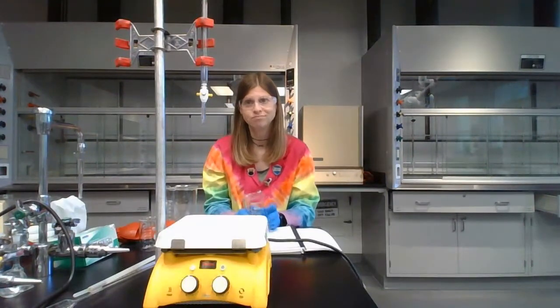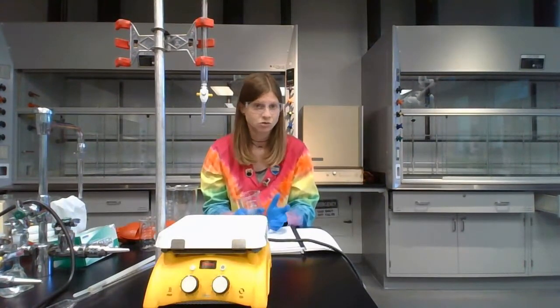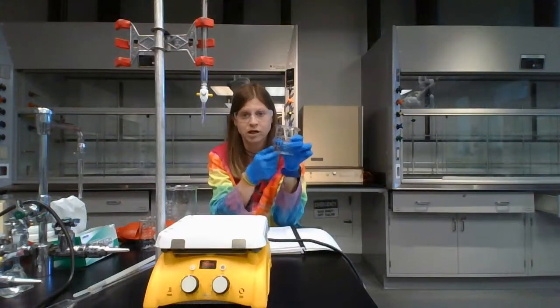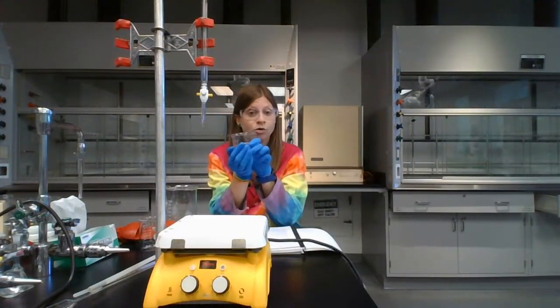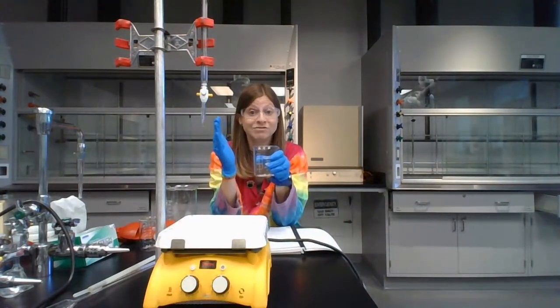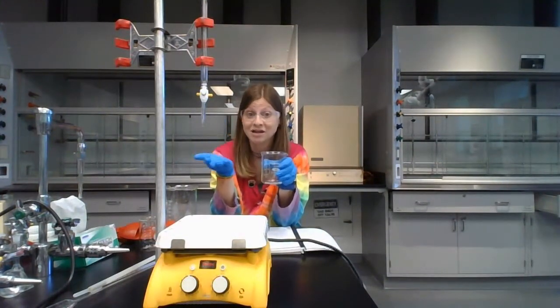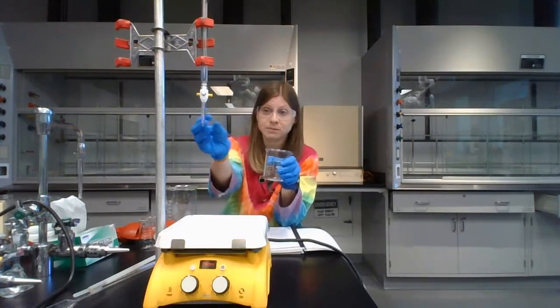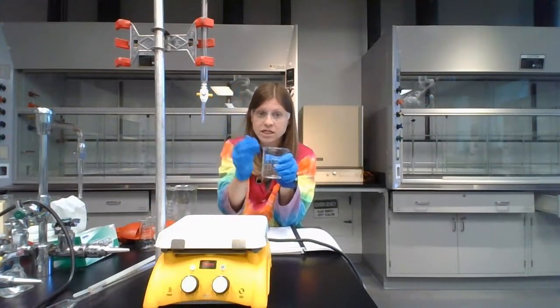Now there are not any indicators for this. The potassium permanganate does its own indication work. This solution will be a clear, colorless liquid, and the stuff in the burette will be dark purple. For the potassium permanganate in the burette, you still have to condition the burette and then load it, making sure there are no bubbles or open spots anywhere, so it's completely filled.